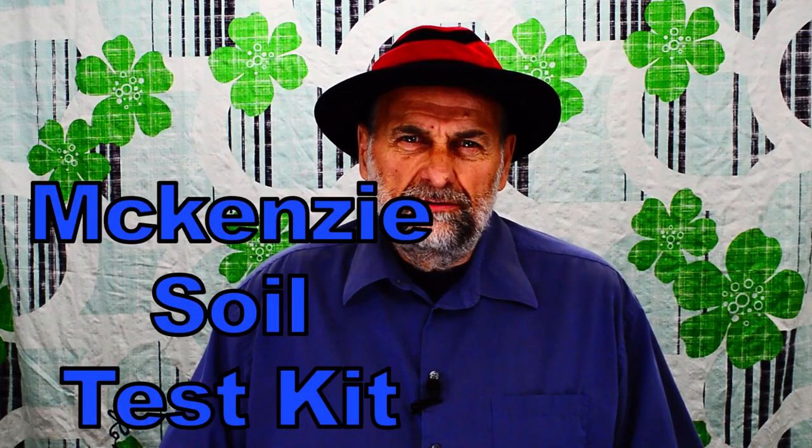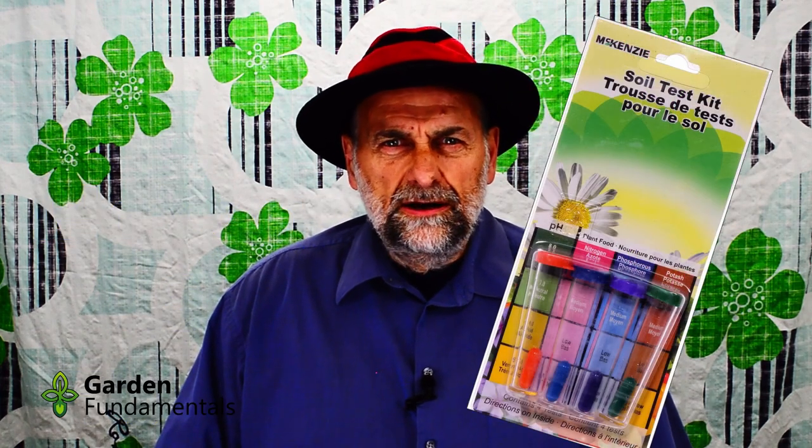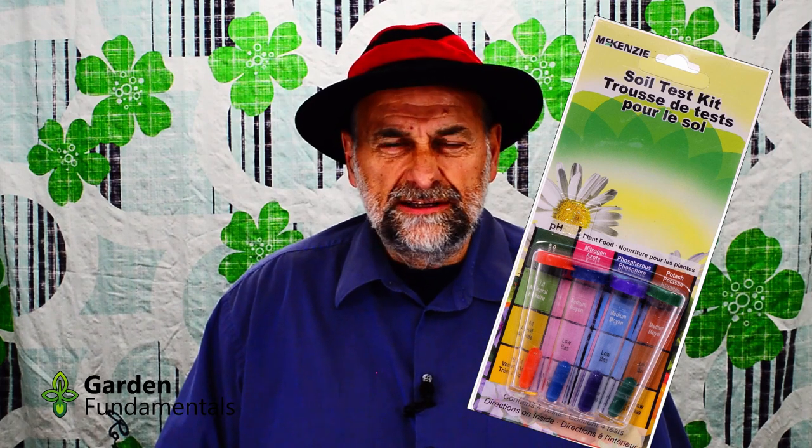In today's video, I'm going to review the McKenzie Soil Test Kit. I'll tell you about the kit, show you how to use it, and then I'll compare the results to results that I got from a professional soil testing lab.